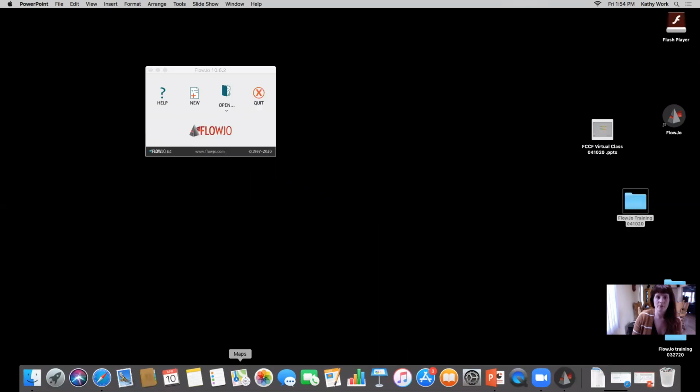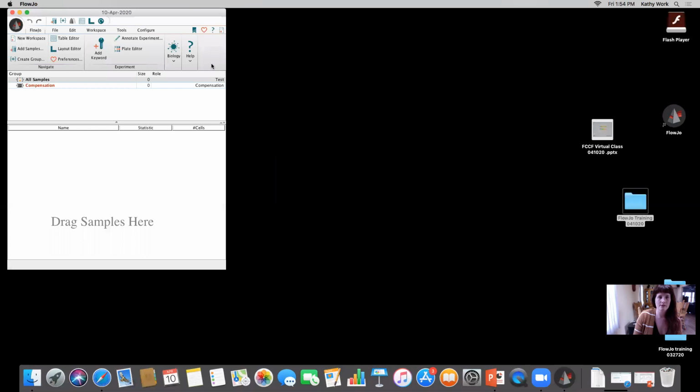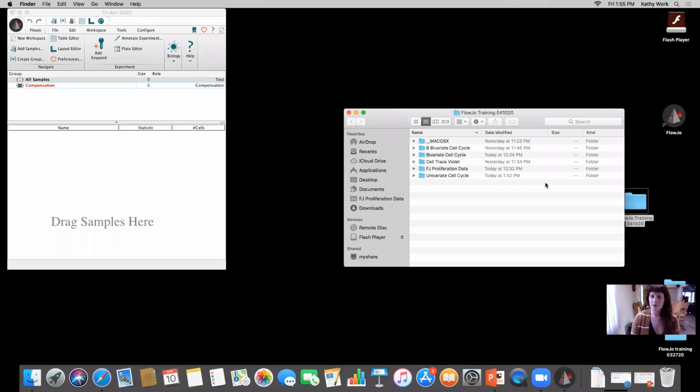Okay, so open up a new workspace, and then we're going to show you our proliferation data. Okay. So if I open up that folder, I want to actually thank John Quinn from FlowJo, who helped me out and sent some proliferation data, and also Stella Chun from Thermo, who also sent me an FCS file showing their CellTrace Violet. So I'm going to show you both of those today.